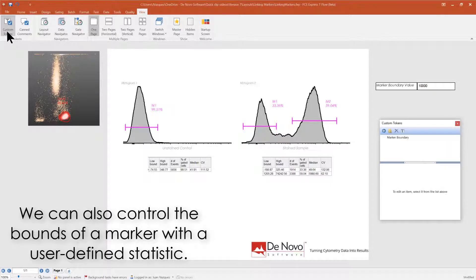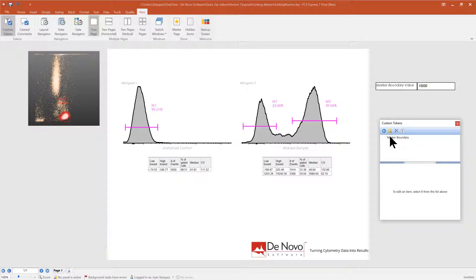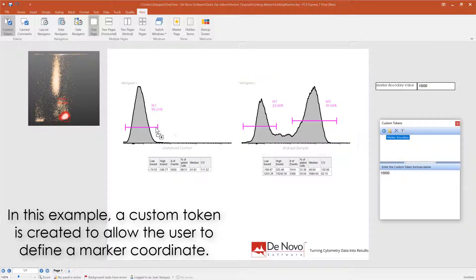We can also control the bounds of a marker with a user-defined statistic. In this example, a custom token is created to allow the user to define a marker coordinate.